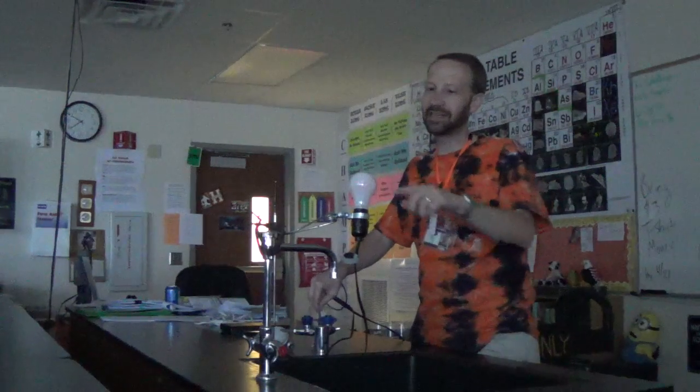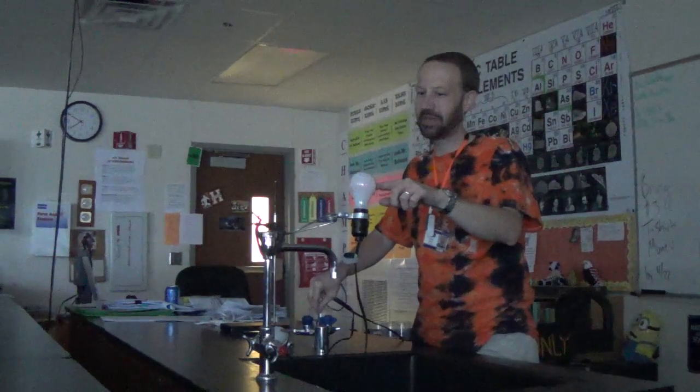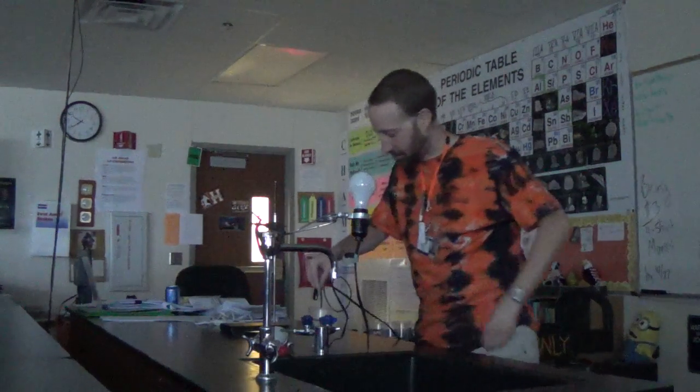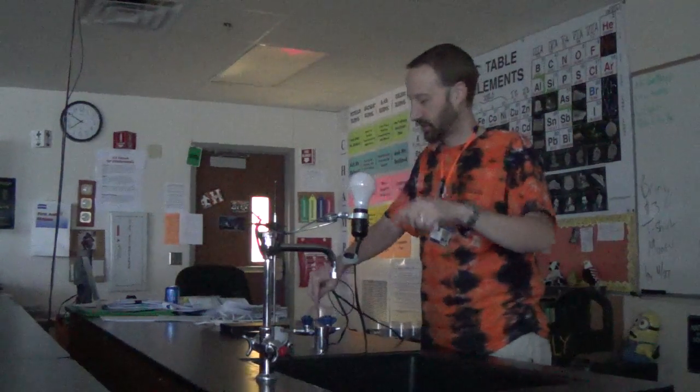Okay, so is it supposed to work in vinegar? It is supposed to. Maybe. If you look closely, you can maybe tell the wire inside the light bulb. No, okay, my wires are touching, sorry. You don't want them to touch. I think I just need to stir this up better or something. Anyway. Those close by can see the wire inside is just barely glowing.